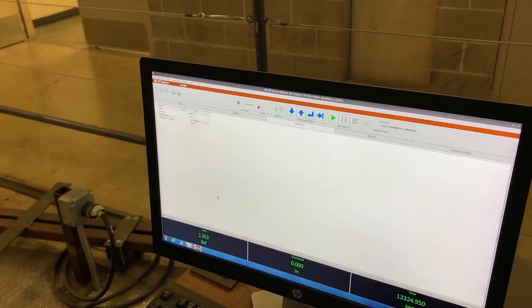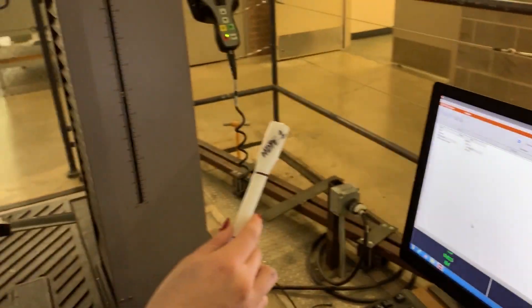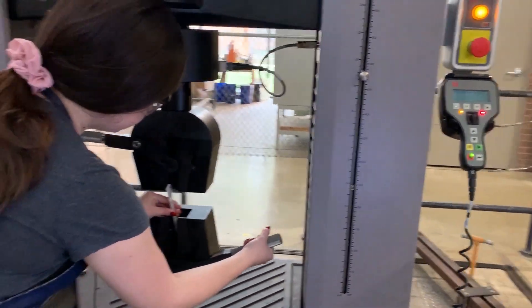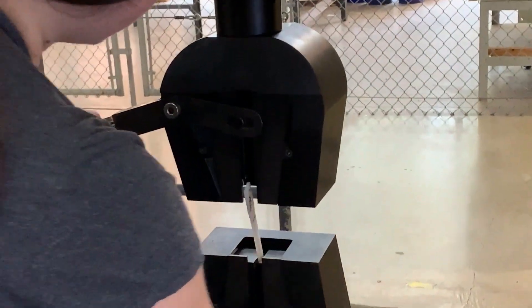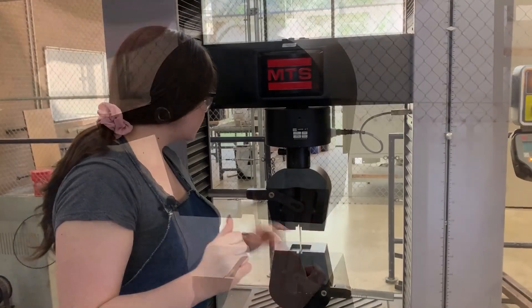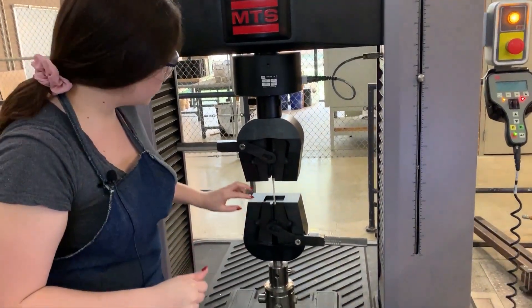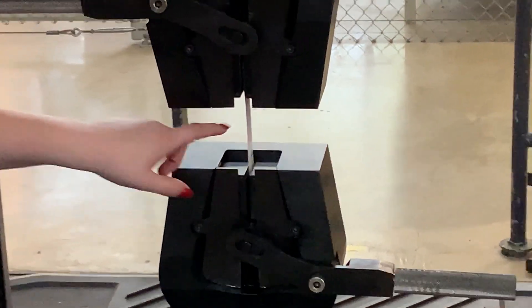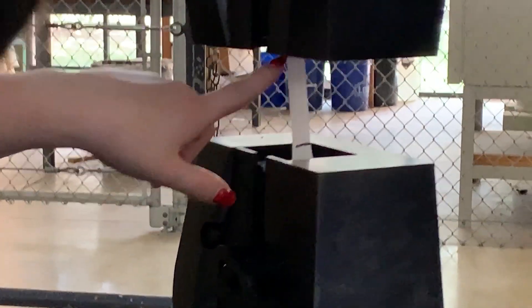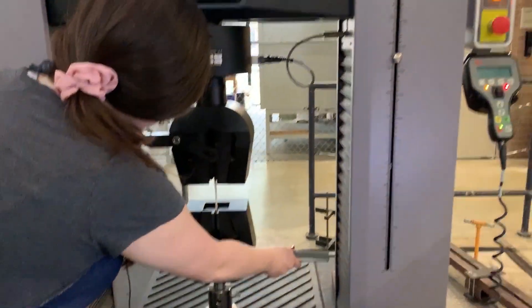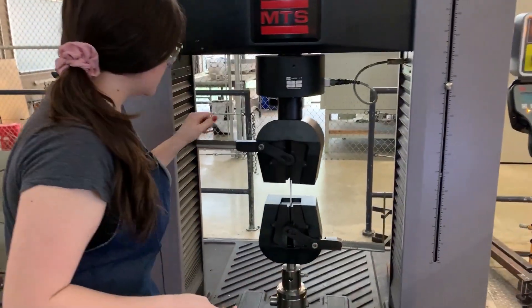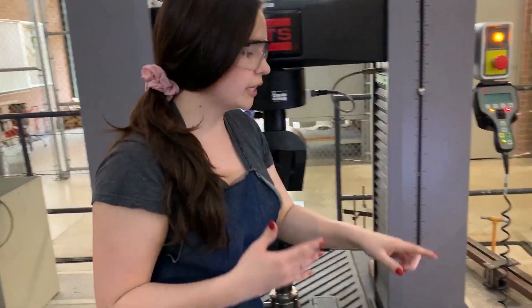We're going to place in our specimen just like we have done every single time — pick this up and flip it over a little bit. We always want to make sure that our dark labels are in between the clamps. We do not want the clamps too far into the specimen or too far out from the specimen.